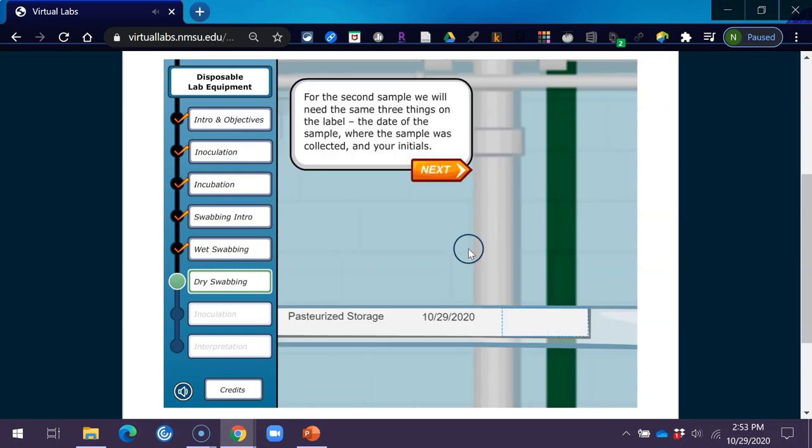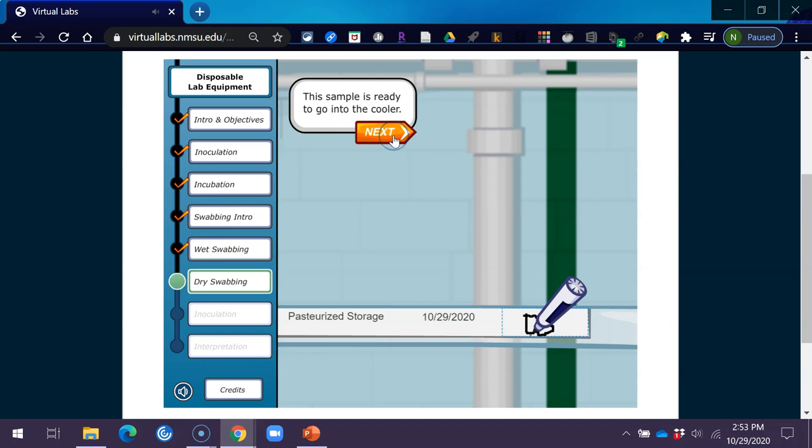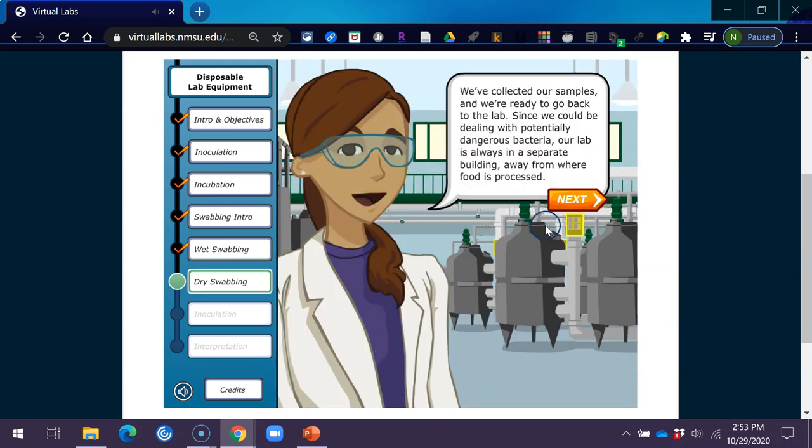For the second sample, label with the date of the sample, where the sample was collected, and your initials. Go ahead and write your initials in the blank area provided. This sample is ready to go into the cooler. We've collected our samples and we're ready to go back to the lab. Since we could be dealing with potentially dangerous bacteria, our lab is always in a separate building, away from where food is processed.